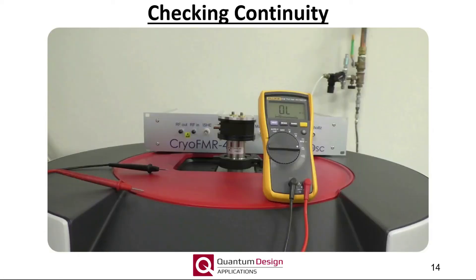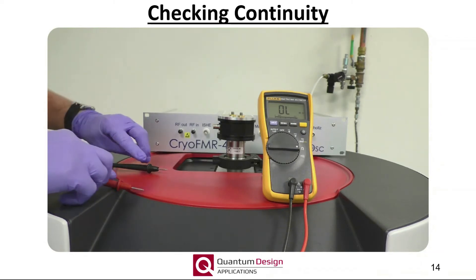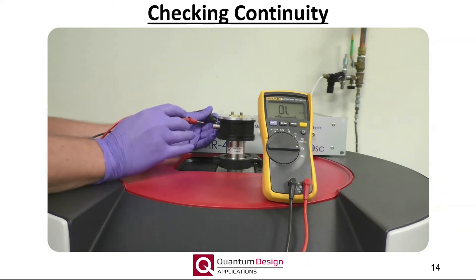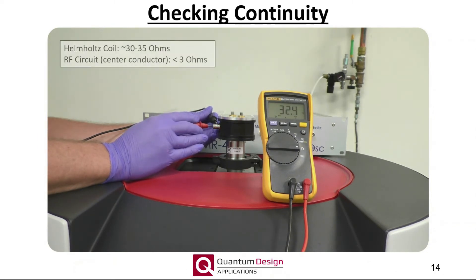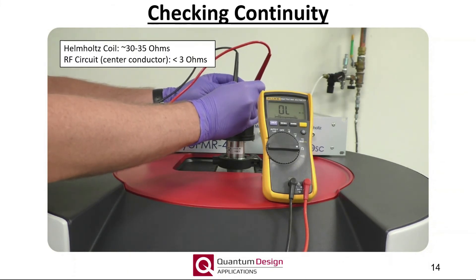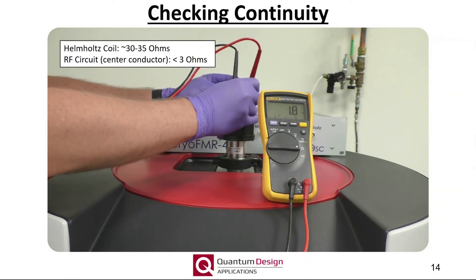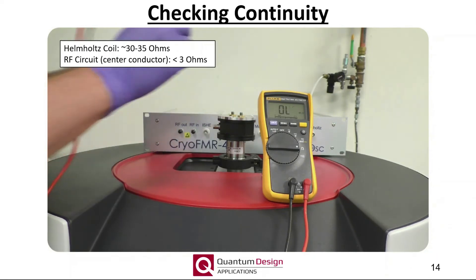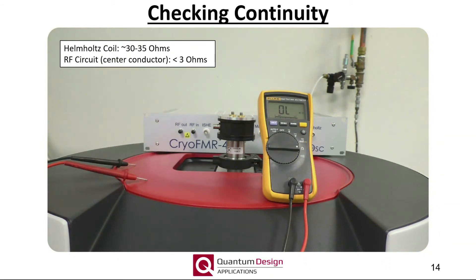Before connecting the cryo-FMR probe to the instrument, it is best to perform a couple of simple DC continuity checks. First, the BNC connection, which applies current to the Helmholtz coil, is checked. The room temperature resistance should be on the order of 30 to 35 ohms. The most common failure here would be an open circuit, in which case the probe will have to be returned to Quantum Design for repair. Secondly, the center conductor of the RF circuit is checked for continuity and should have a resistance below 3 ohms. Note, if you have the cryo-FMR probe suitable for 40 GHz, and therefore 2.92 millimeter K-type connections at the top, take note that these are very delicate and can be easily damaged if one presses too firmly with the multimeter leads. The most common failure here would be an open circuit, which is probably just due to one of the SMPM connections breaking free, in which case the probe should be removed from the system and checked.